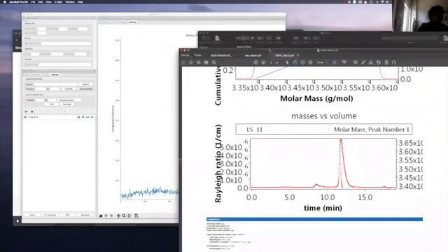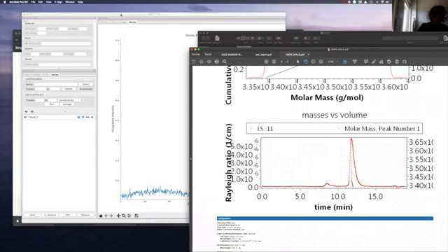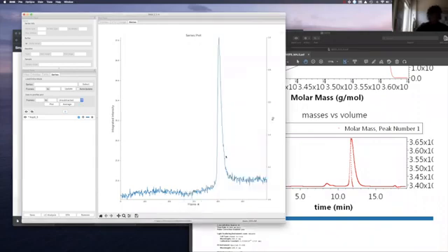That's the first information. But let's look at the SAXS data and just make a SAXS assignment. What is the molecular weight? This is the integrated intensity across the whole scattering profiles that we are giving to you.